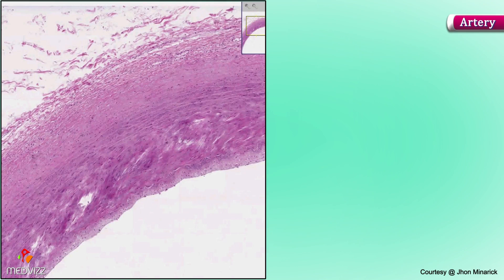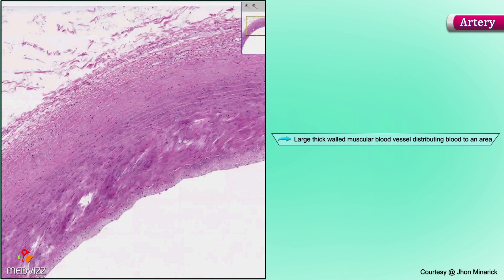Here is a typical artery. An artery is a large thick-walled muscular blood vessel distributing blood to an area rather than from it.